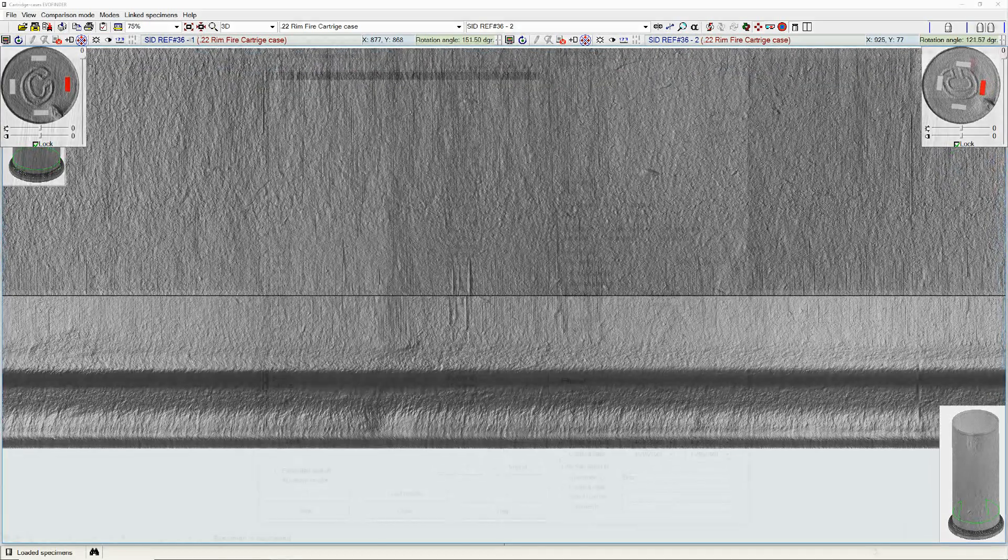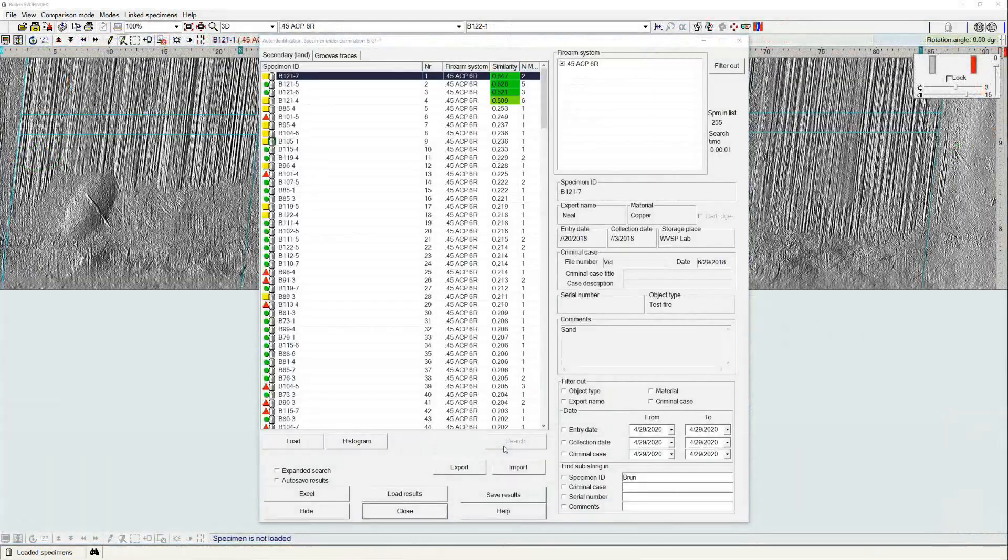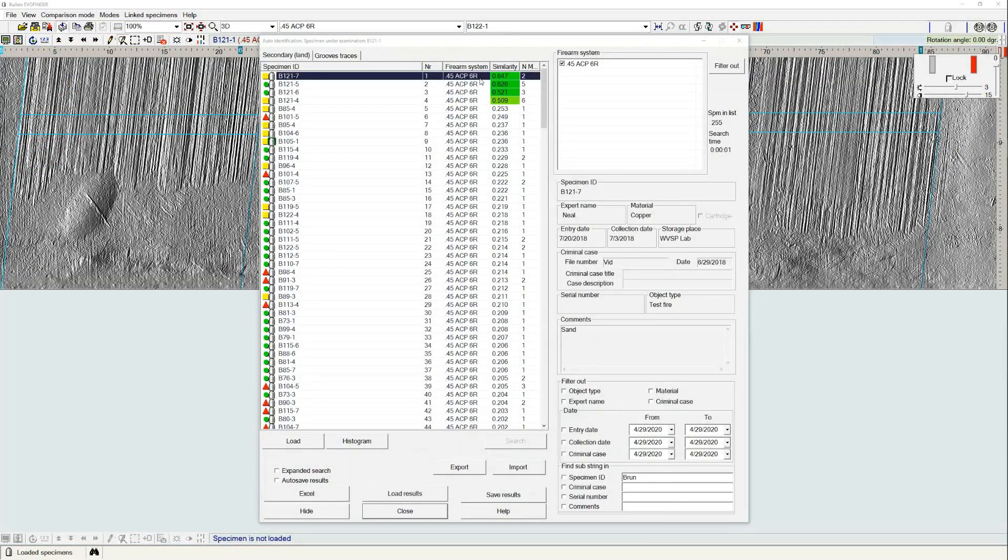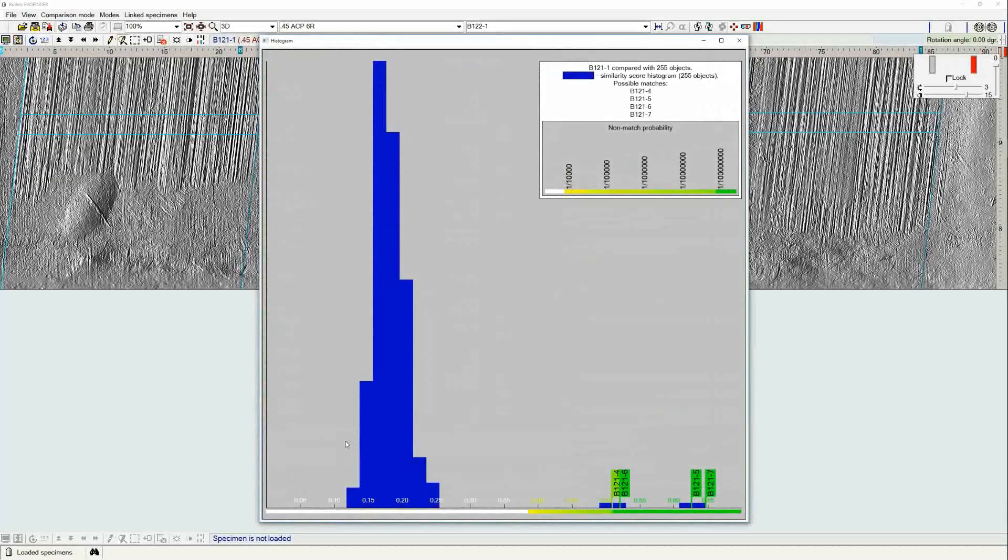The EvoFinder software provides virtual comparison microscope capability in addition to industry leading algorithms to generate accurate hits that can be used to provide time sensitive results.